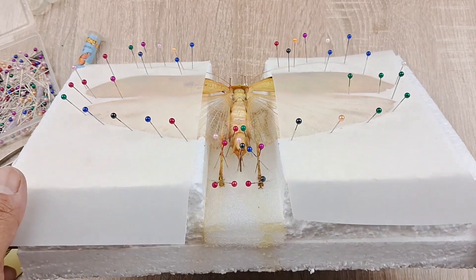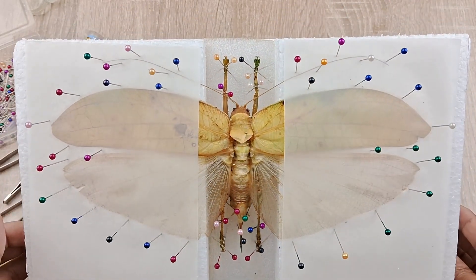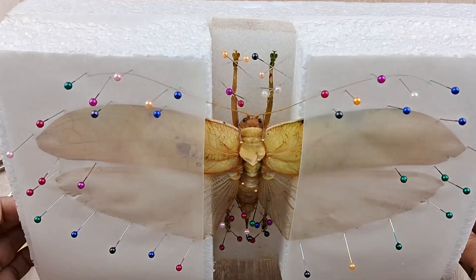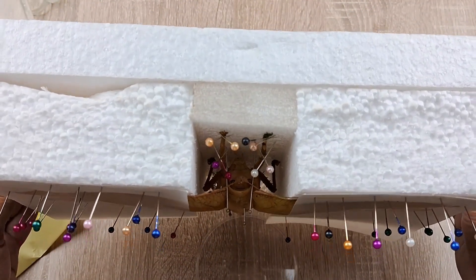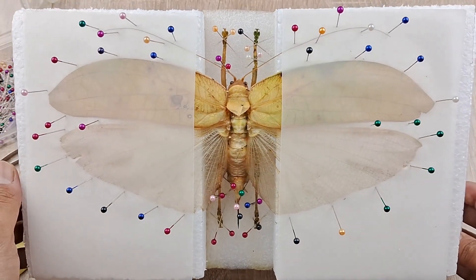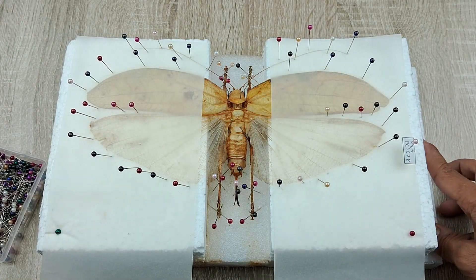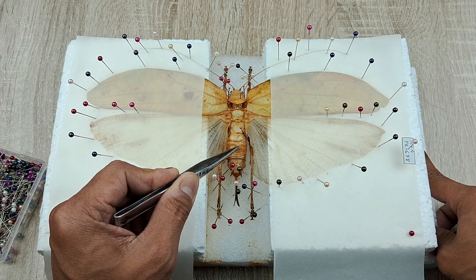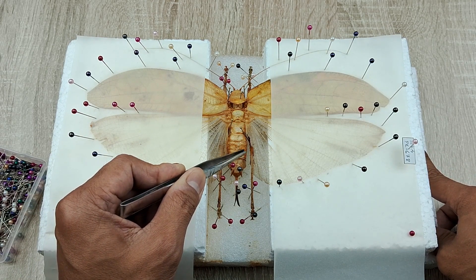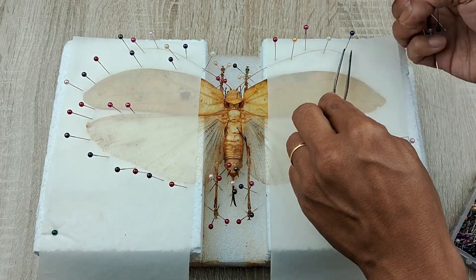During the drying process, which can take anywhere from a week to two weeks, keep a close eye on your drying specimen and check every day, as small insects such as ants and dermestids would definitely want a bite out of your precious specimen. At the end of a week or two, check the dryness of the specimen by gently poking the abdomen with the blunt end of a pin or forcep to make sure it is hard and rigid. If so, begin unpinning the specimen carefully from the mounting board.